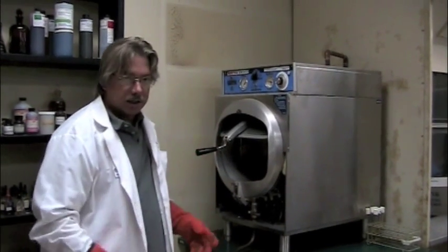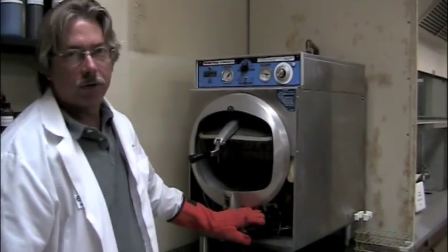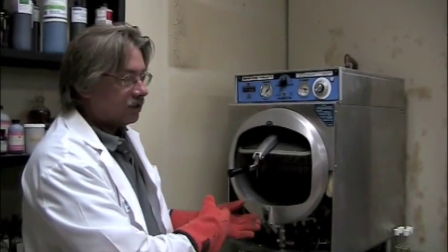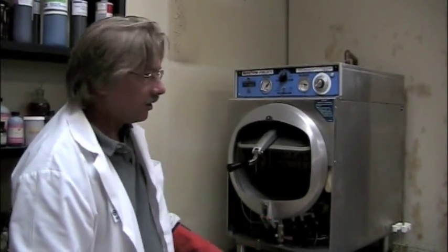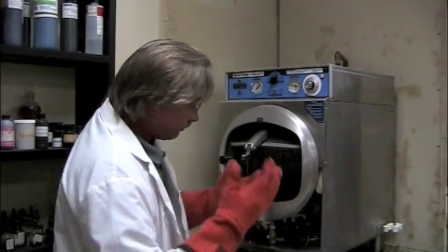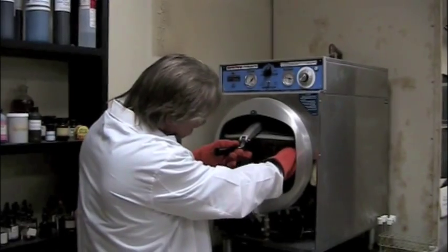We've run the autoclave through its cycle and I've drained the hot water out of it. We want this media to start cooling down, and before you reach in there it's best to get that really hot water out. I've opened it up and I'm going to remove our samples. I've got my autoclave gloves on because everything is very hot at this point.